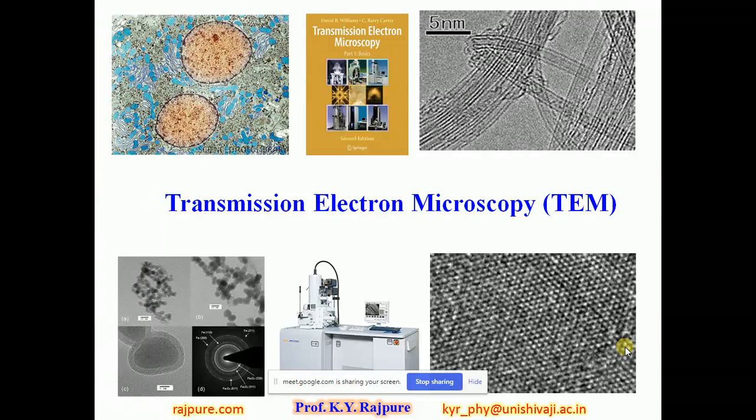Sometimes students get confused between the words transmission and tunneling, because for TEM the only name is transmission electron microscopy, but in AFM we have a tunneling mode as well.